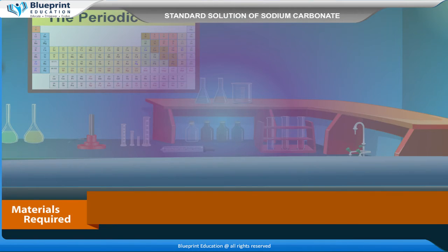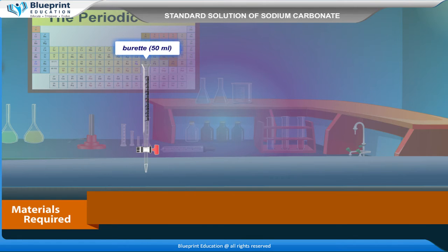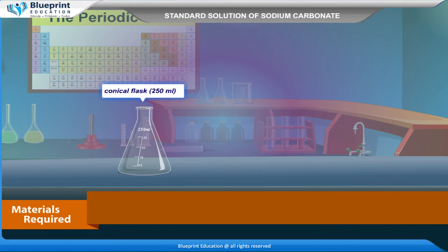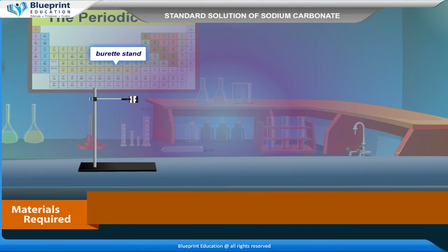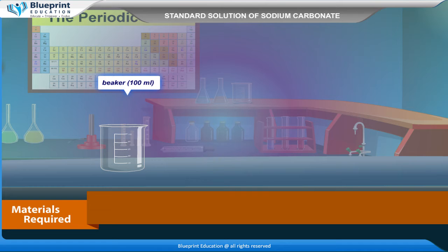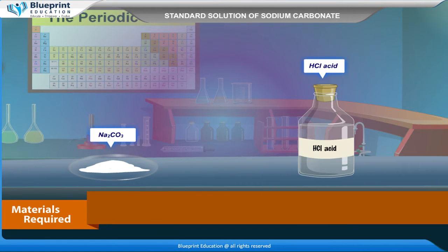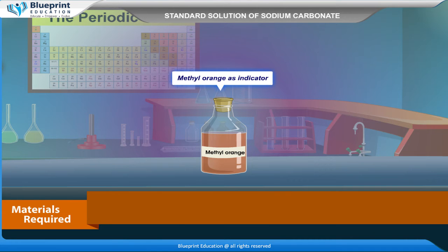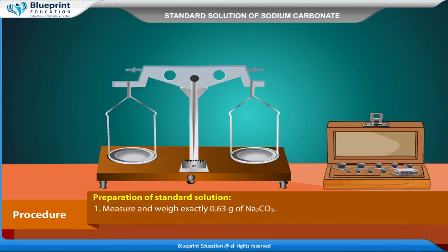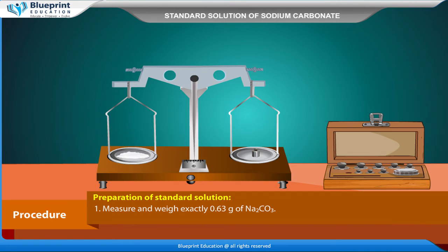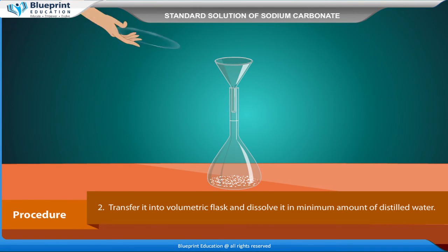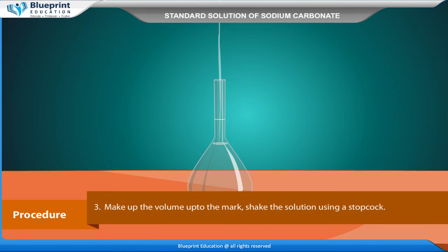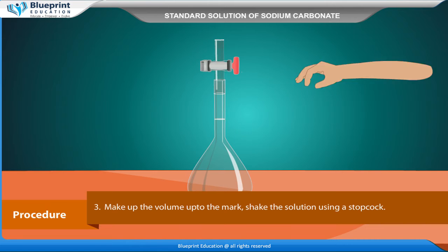The materials required are: [listed on screen]. Procedure — Preparation of standard solution: Measure and weigh exactly 0.63 gram of Na2CO3. Transfer it into a volumetric flask and dissolve it in a minimum amount of distilled water. Make up the volume up to the mark. Shake the solution using a stopcock.